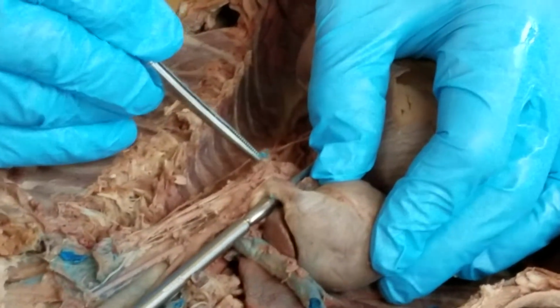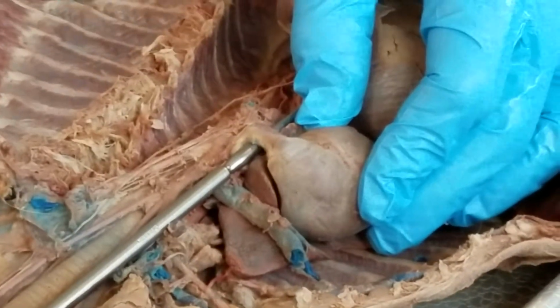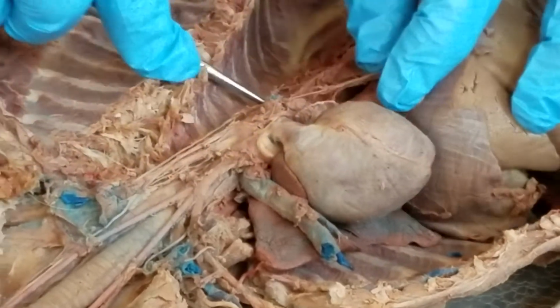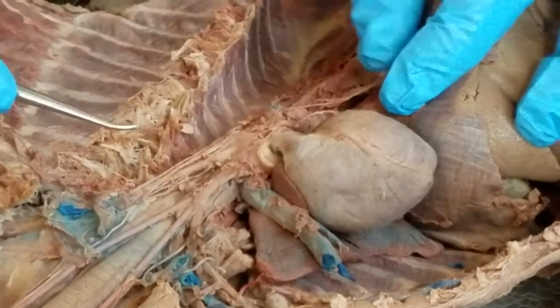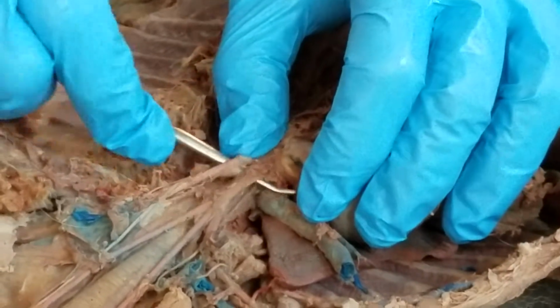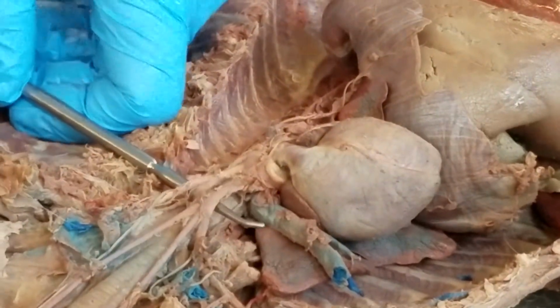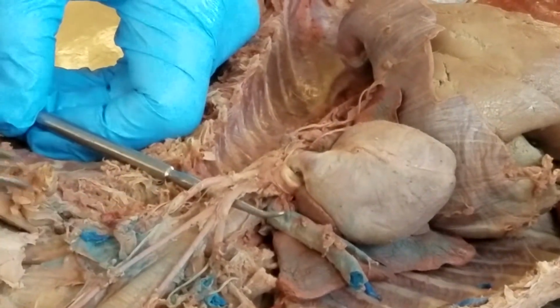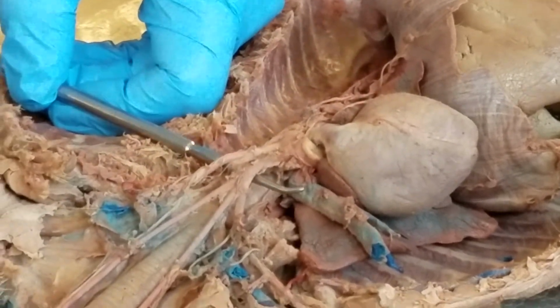Going into the pulmonary artery, just like you saw on the pluck, same thing. Now, here's the aortic arch, and here's your descending aorta coming down towards the abdomen. First 2 major branches off that arch is going to be what? I told you before. Brachiocephalic, left subclavian. It'll go into this left arm, all right?